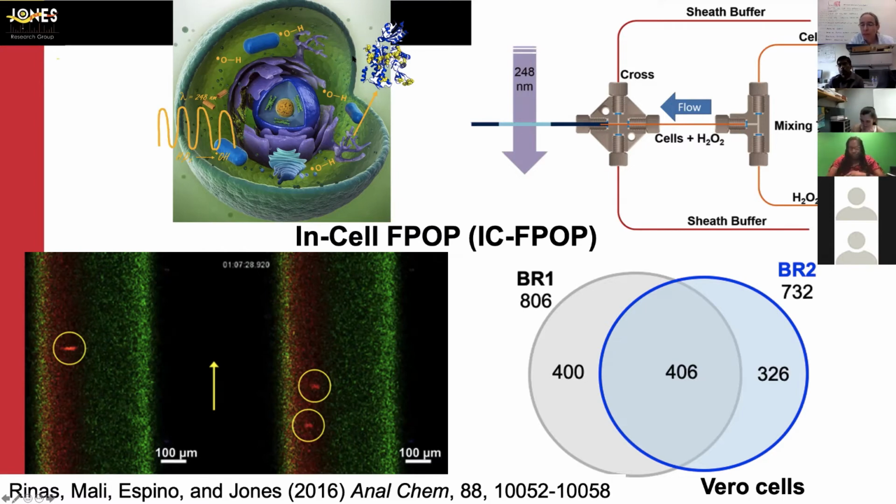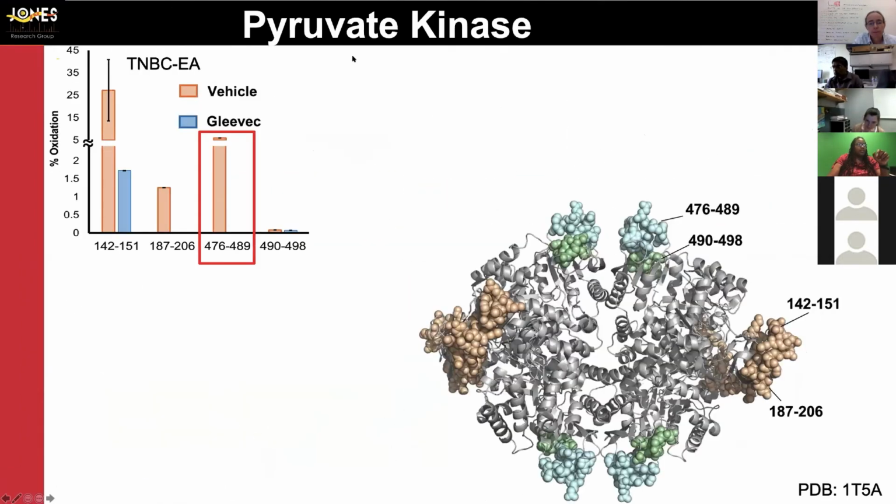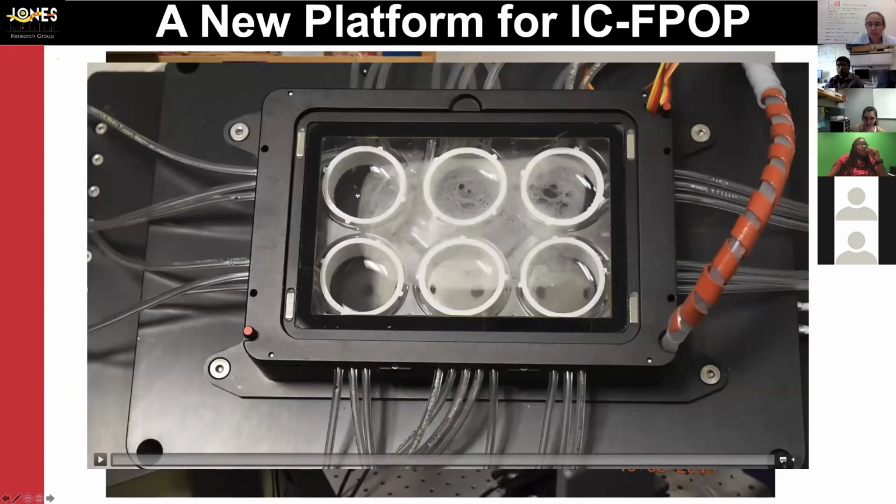So we have one more question in the chat window for Lisa, which is, what are the cell number requirements for the in-cell work? Okay, so right now we're using 1 million cells, which seems high. I'm not sure if you think about it as someone who does cell culture or not. Actually, 1 million cells is the confluency of a single layer on a well of a 6-well plate. So if you're doing cell culture, that's not a whole lot, but it is a lot, 1 million cells.